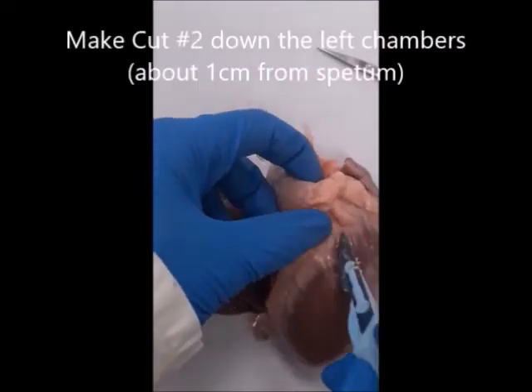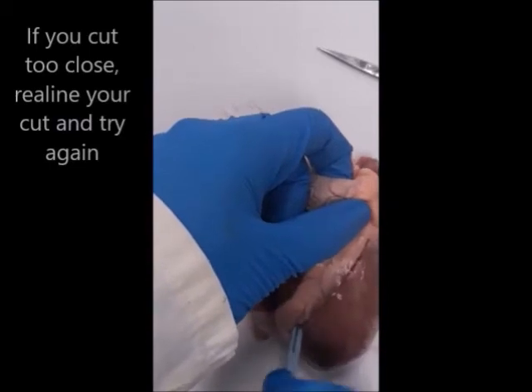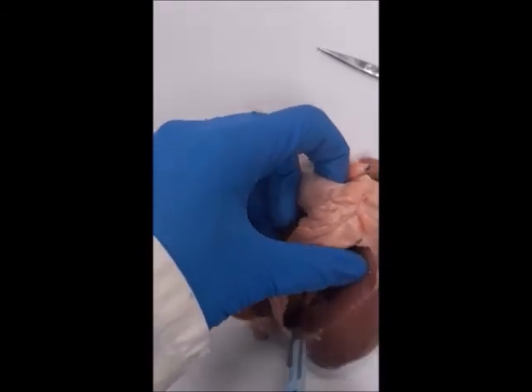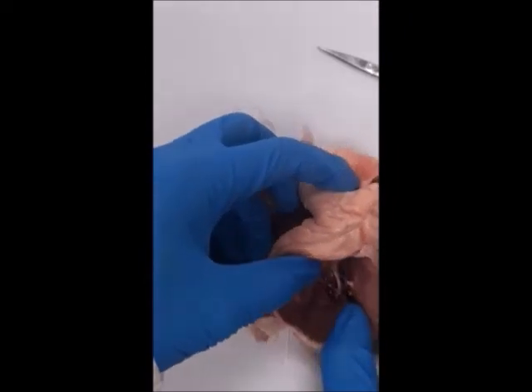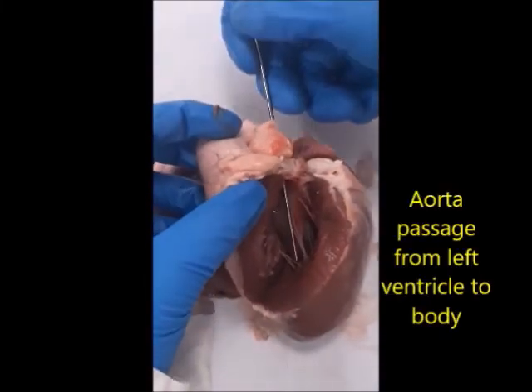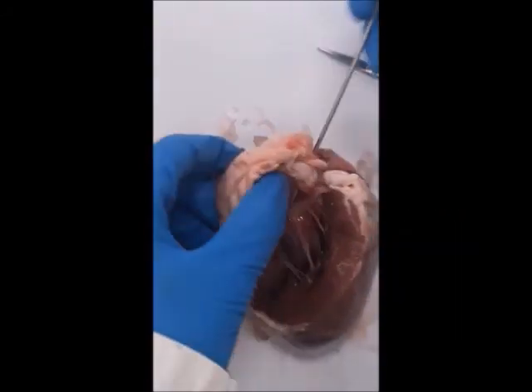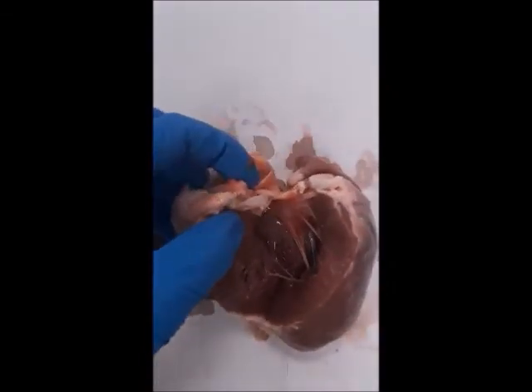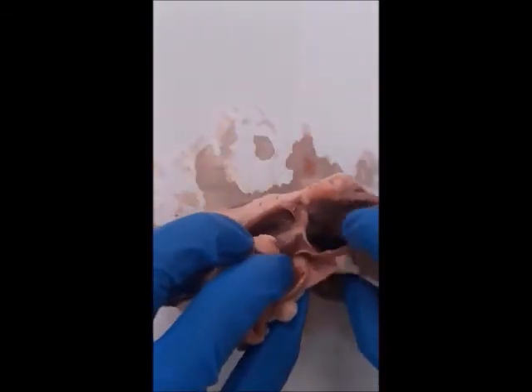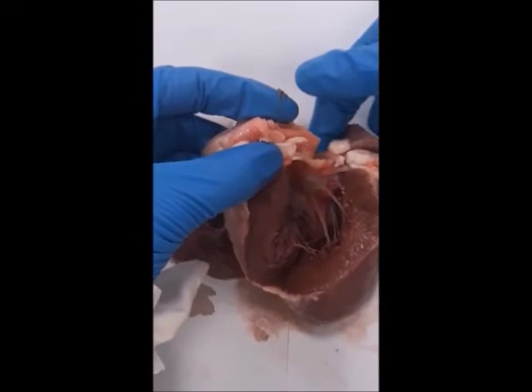Now we make our incision for the left chambers, starting about one centimetre from the septum and cutting in. The wall will be much thicker, so you need to cut deeper — I can see the tendons, so I'm cutting a little deeper past the myocardium. If we stick a blunt probe into the aorta, we'll see it drop down into the left ventricle at the bottom. Let's take a look at the left atrium and the bicuspid valve. Entering through the pulmonary vein, you can see a thin membrane stopping my finger from going any further.